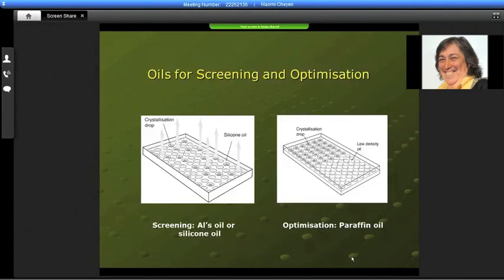And like I was saying, the paraffin oil does not allow evaporation through it, and it's good when you want to keep the situation steady, so you know where you are. Say, for example, you want to dilute an experiment, then in microbatch it's easy. You know what the conditions are, and if you dilute, for example when backing off from conditions, you know exactly how much and what's happening.